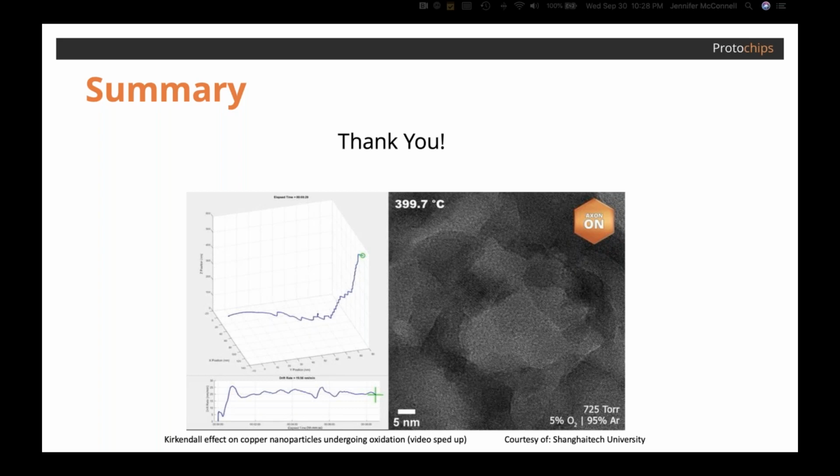Yeah, that's a great question. You touched on this a little bit during the presentation. Throughout the course of an experiment, AXON is always taking the live images and the metadata and saving it off into the drive on the AXON core. But one feature you mentioned is this tagging feature, which allows a user to tag sections that are particularly important to them that they may want to transfer later.